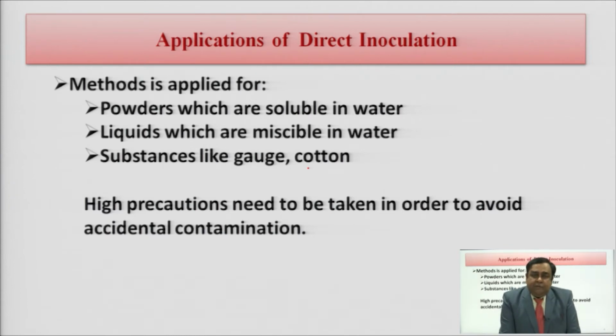That is, the media which you are using and the glass apparatus which you are using mandatorily need to be bacteria or fungi free, that is, free from microbes. The environment where you are carrying out this test mandatorily needs to be aseptic.